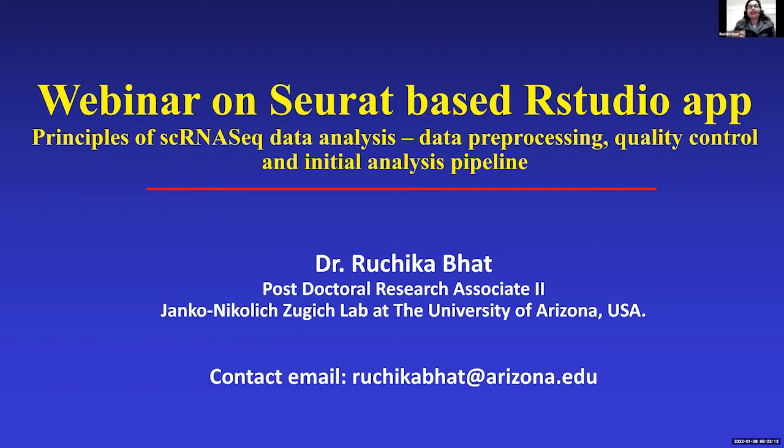Today I will be walking you through a Seurat-based RStudio app on CyVerse. But before we get started, I would like to brief you about some basic principles of what single-cell RNA-Seq data analysis is about, like pre-processing of data, some quality checks, and some initial analysis that goes downstream of the pipeline. So this webinar will be more geared towards introducing anyone who would like to do single-cell RNA analysis on their own, and they don't have much resources, but they have a ready-to-use app on CyVerse. This webinar will be a handy tutorial for you.